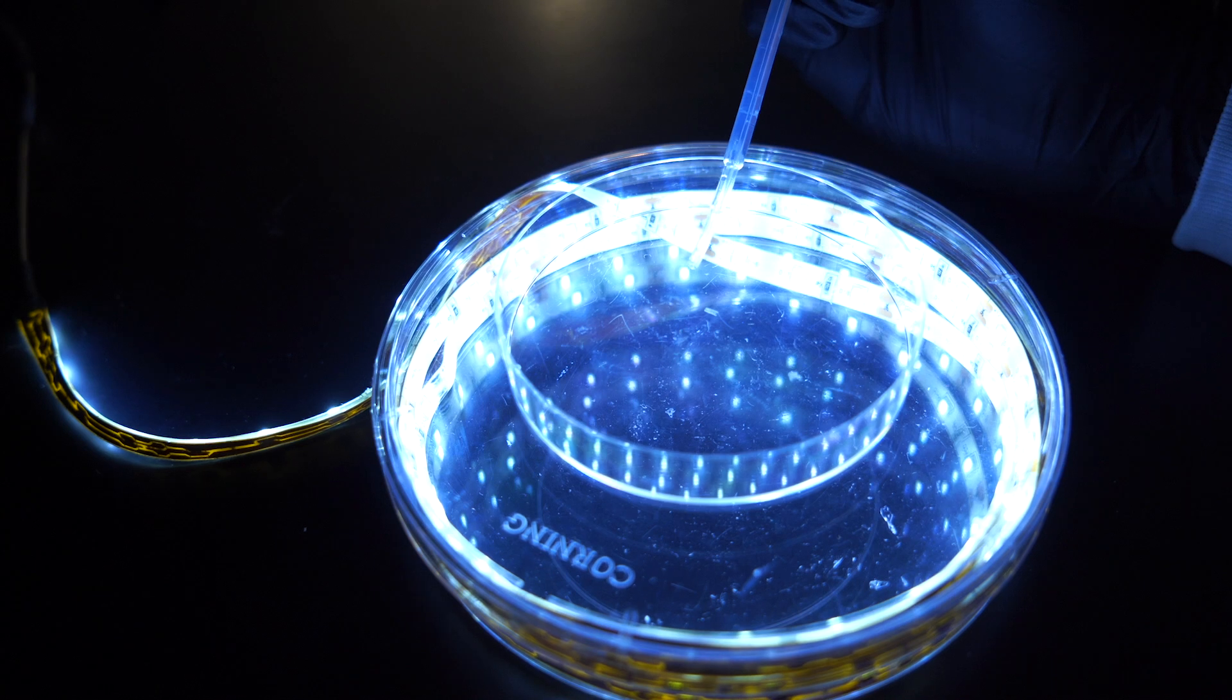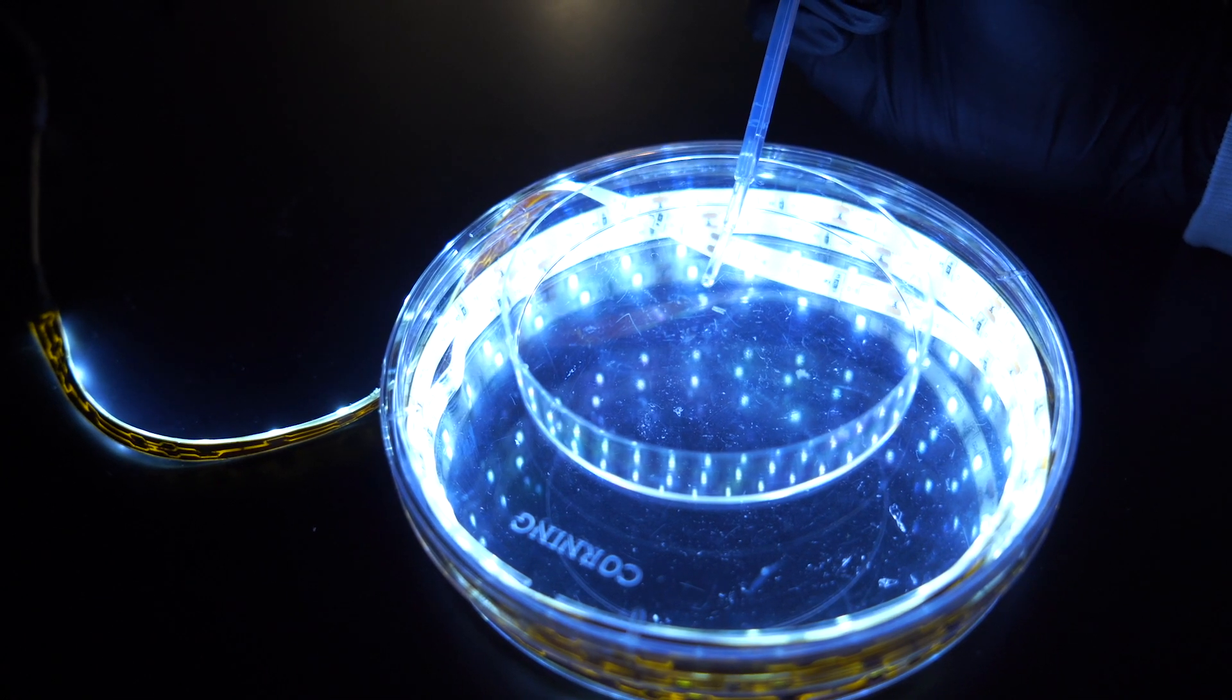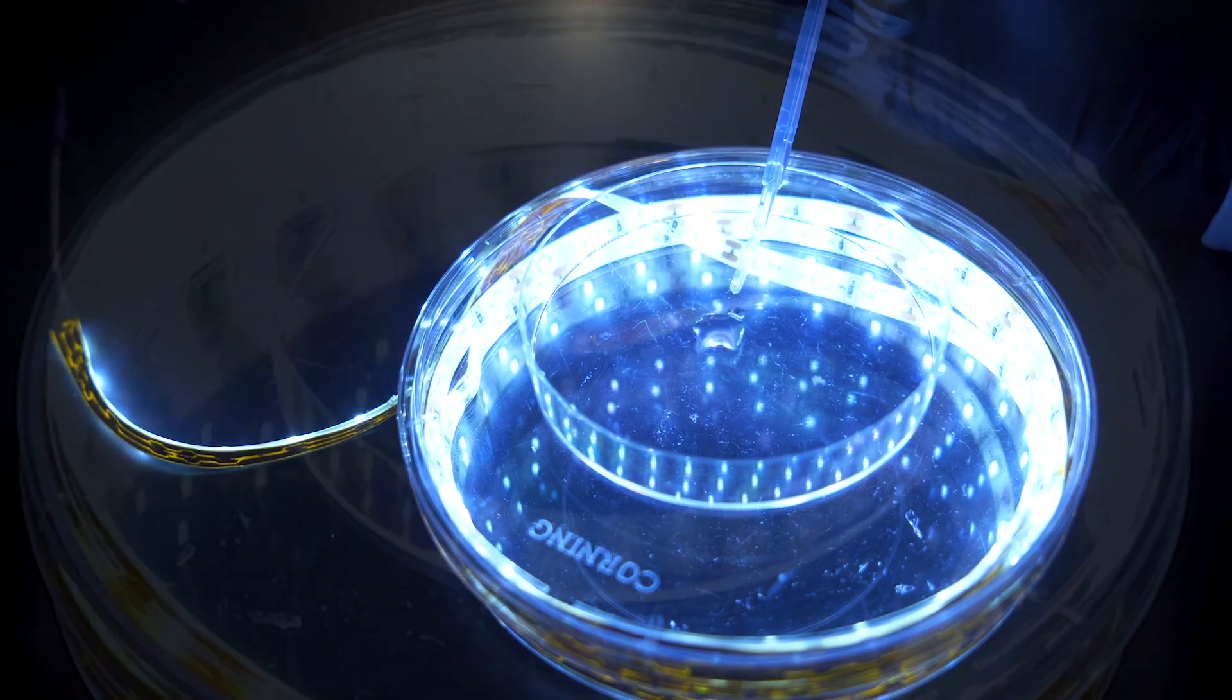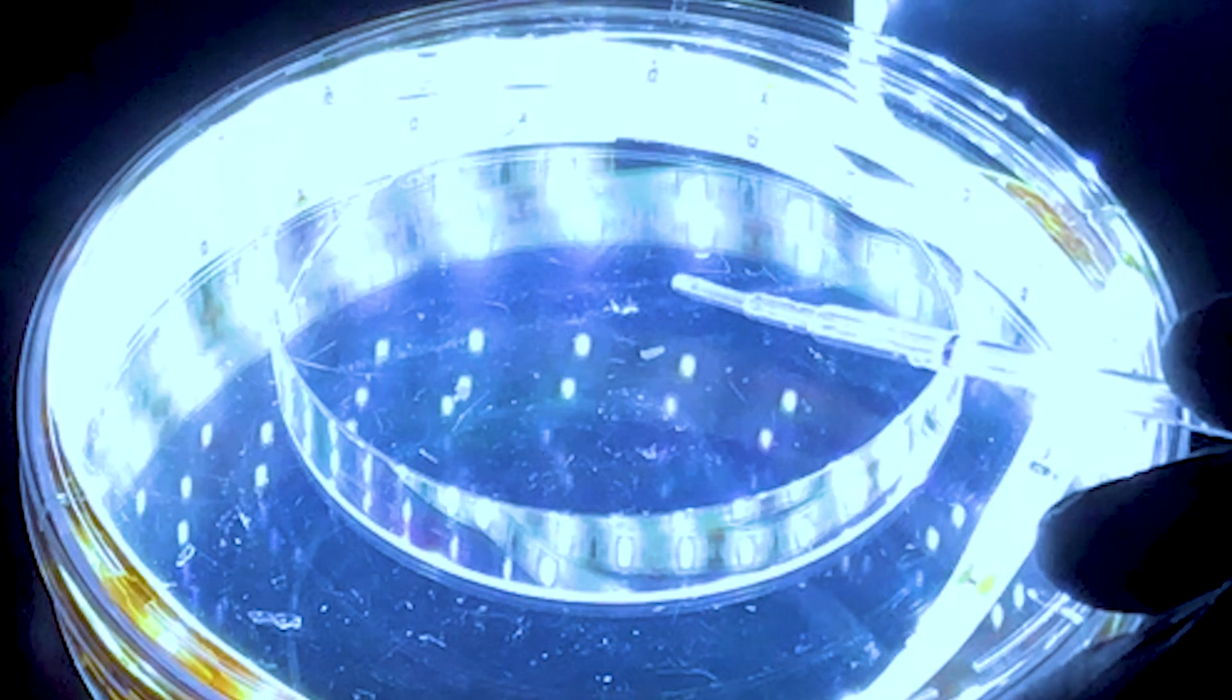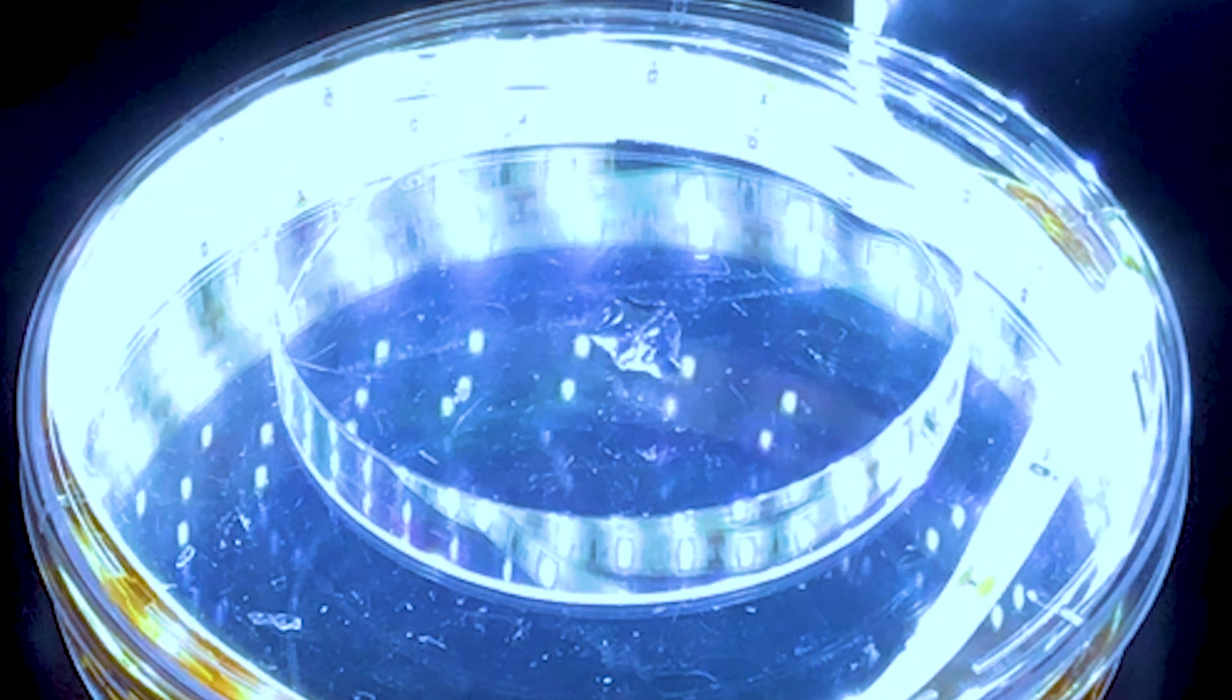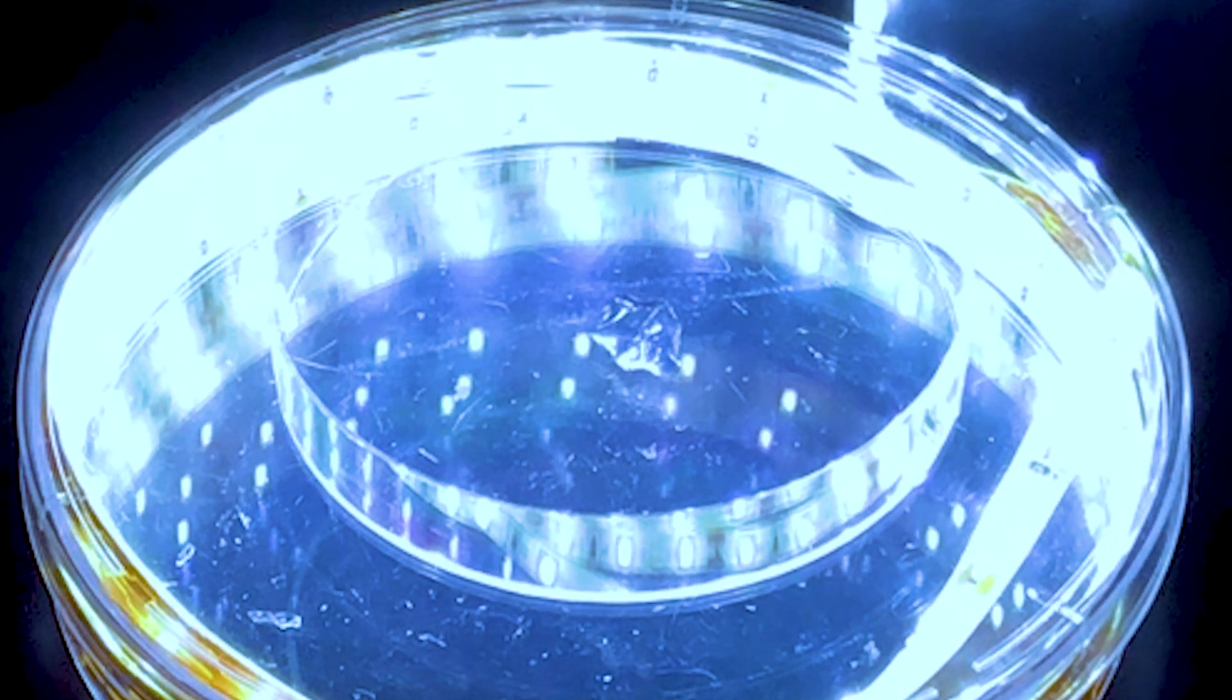Expansion microscopy is an emerging imaging technique that can allow you to see very fine details of biological specimens. Basically, you take the biological specimens and infuse it with some chemicals, just like baby diaper materials, and then you add pure water on these chemicals and then it will enlarge a hundred times in size along with the tissues.